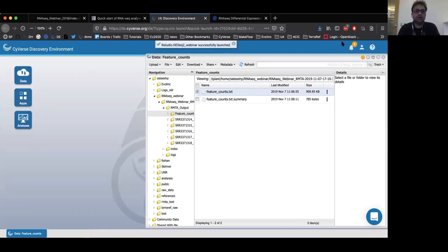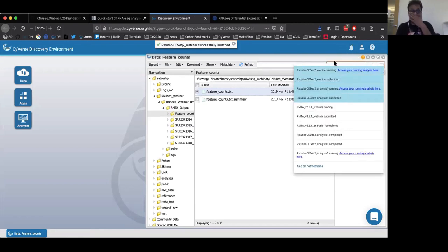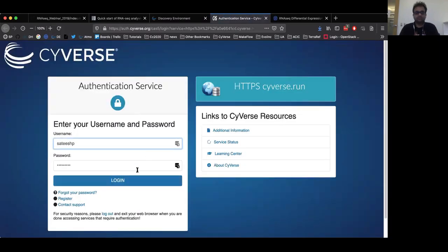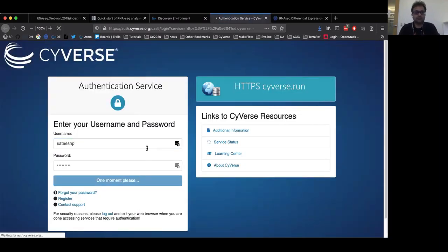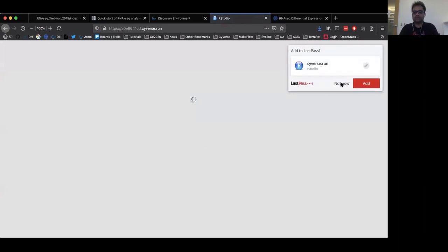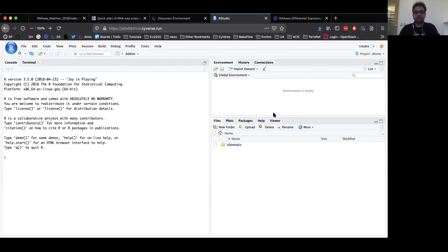Launching VICE apps will generate a particular URL which you can click to open that app in a new tab in your browser. Once you have submitted the DESeq2 app to the discovery environment, you will get a link that says 'access your running analysis here.' By clicking on that, first you'll be asked to authenticate using your Cyverse credentials. Once you're in, you will be presented with the RStudio login page. The username and password for logging into RStudio are both 'rstudio' — all lowercase letters. Click sign in and we should now be in our RStudio interactive app.